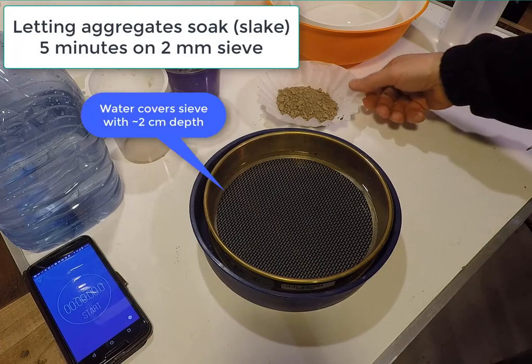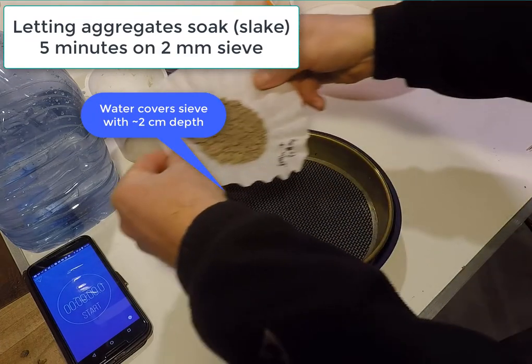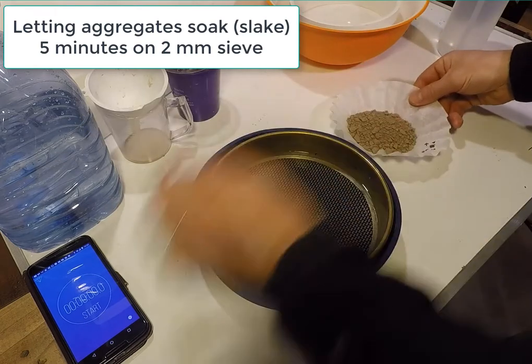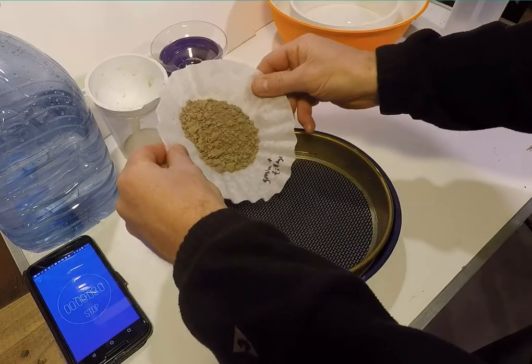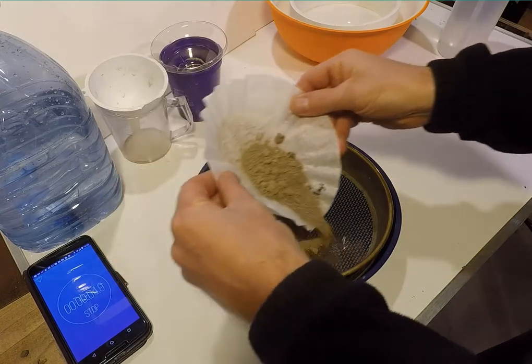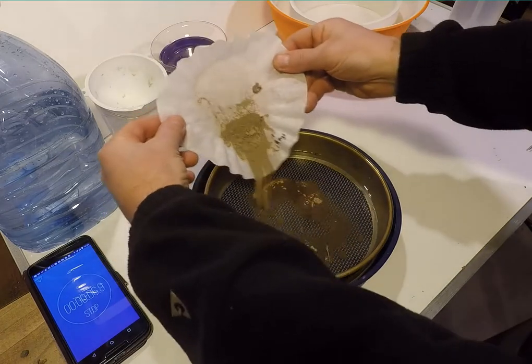To start the analysis, a sieve is submerged in water so that the screen has 1 or 2 cm of water on it. Then the soil is poured onto the sieve and left for 5 minutes to soak, so that aggregates will slake and begin to break apart if they are not strong enough.